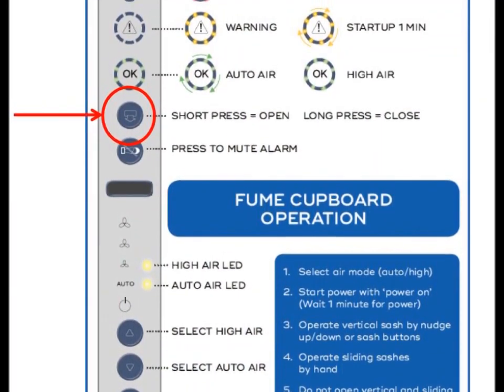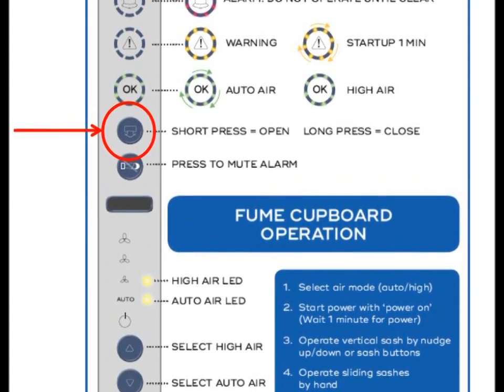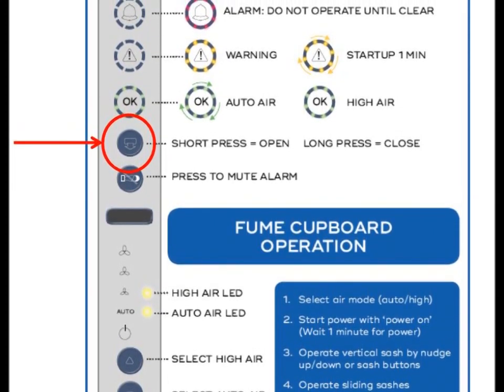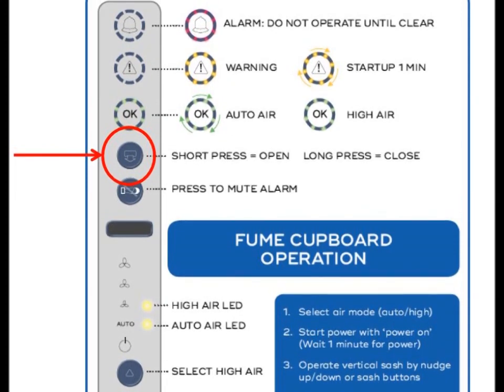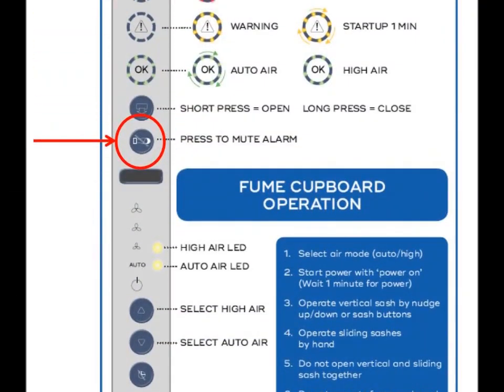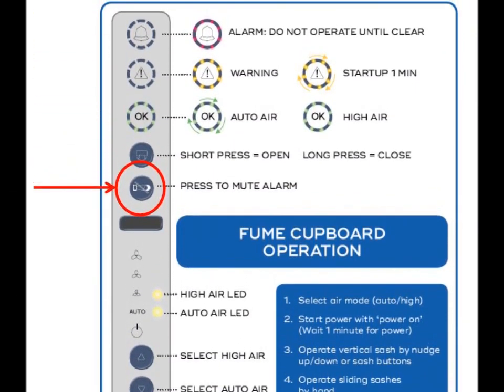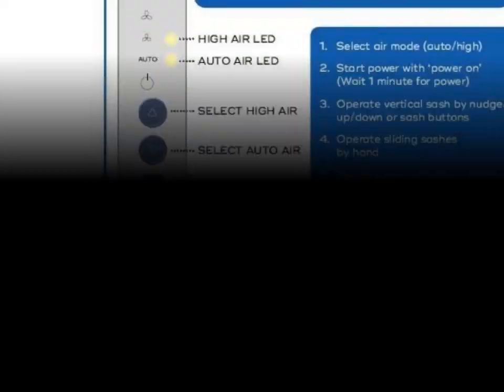The sash button, immediately below the LED indicators, can be used to operate the vertical sash: a short press commands the sash to travel to the maximum position, and a long press commands it to travel to the minimum position. The mute button is immediately below the sash button and is used to silence audible alarms. Important: audible alarms indicate a safety issue and should be resolved before continuing work at the fume cupboard. The light button operates the light in the work area.